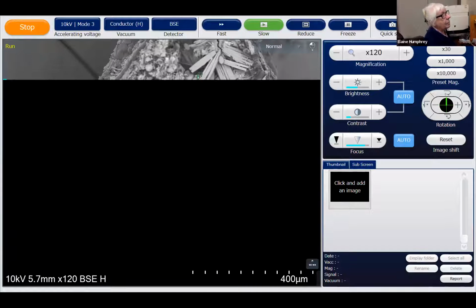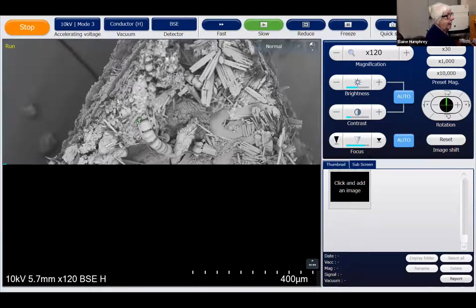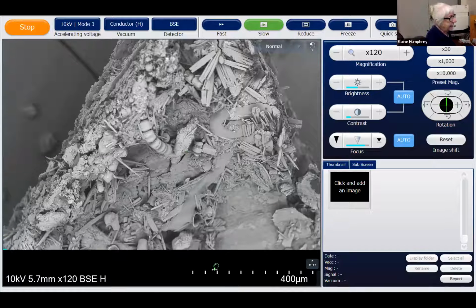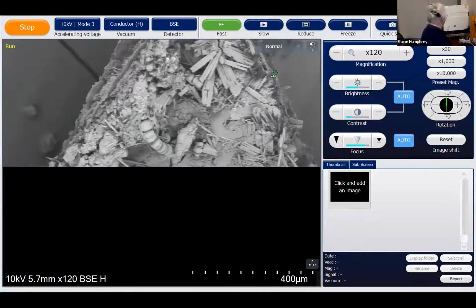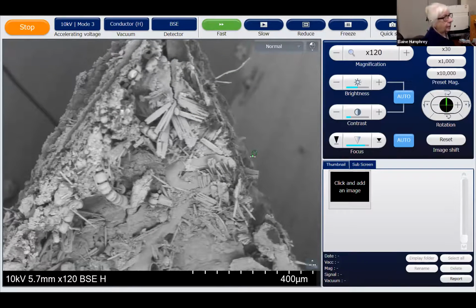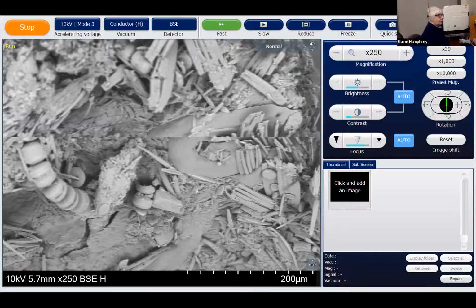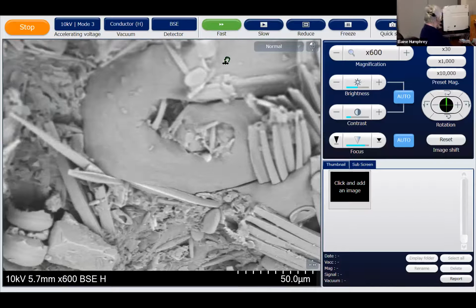So now we've got a lot more of the matchstick kinds. We've got a few more coccoliths and a whole bunch more marshmallows, which some people think of as necklaces. And there's two tintinnids side by side. And here is an annelid. So if I go back to fast and I move in, if any of you have looked at an earthworm, you know an earthworm is segmented, but it has holes along its segments. And this one is a marine annelid.